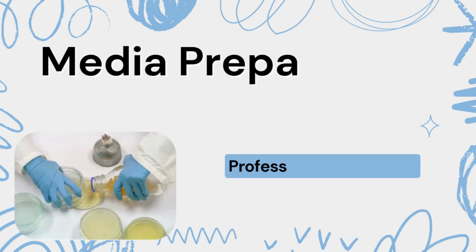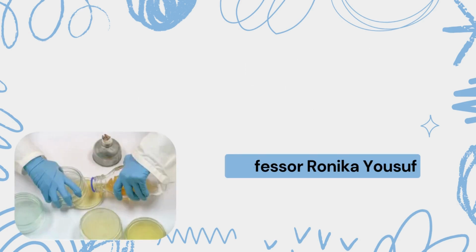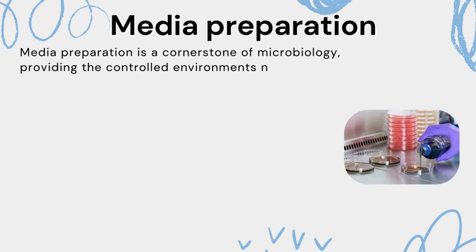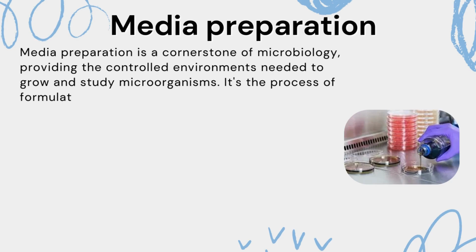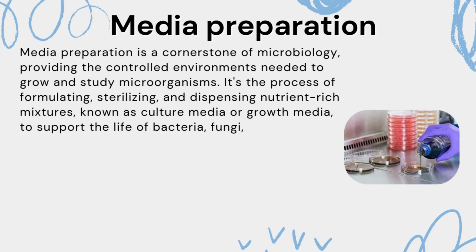Hello everyone, today we will discuss media preparation in microbiology. Media preparation is a cornerstone of microbiology, providing the controlled environments needed to grow and study microorganisms. It is the process of formulating, sterilizing, and dispensing nutrient-rich mixtures known as culture media or growth media to support the life of bacteria, fungi, and other microbes in the lab.